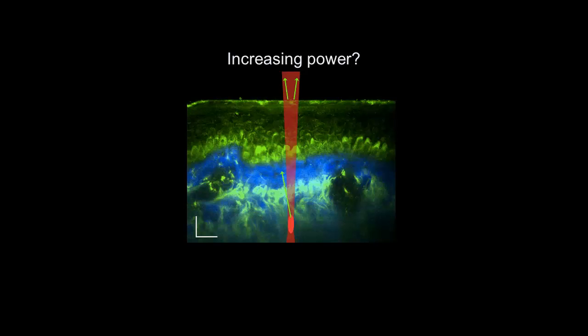Yes, we have one more question. I was wondering if you knew if anybody has been using a combination of nonlinear with 4pi microscopes to gather the signal. I don't know if you've heard of 4pi. Do you know about that, Basan? I'm not sure about this combination.